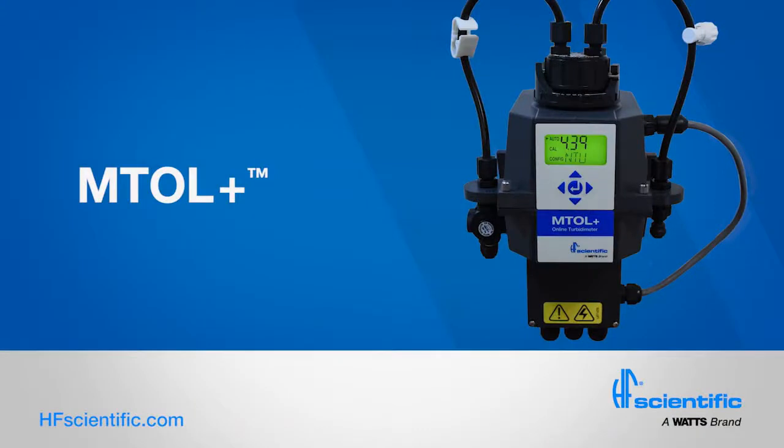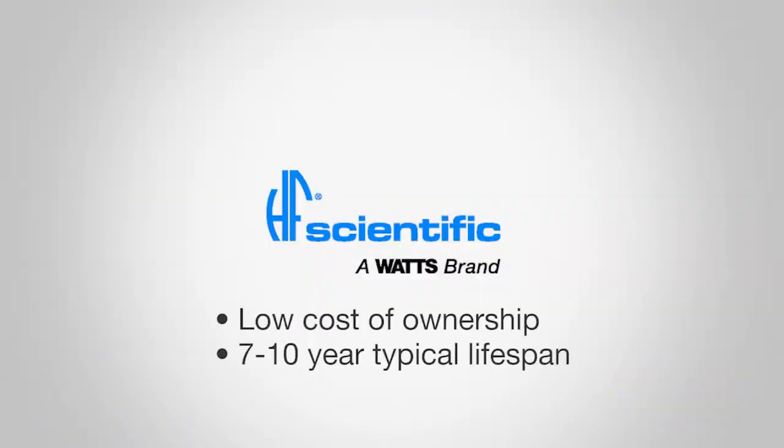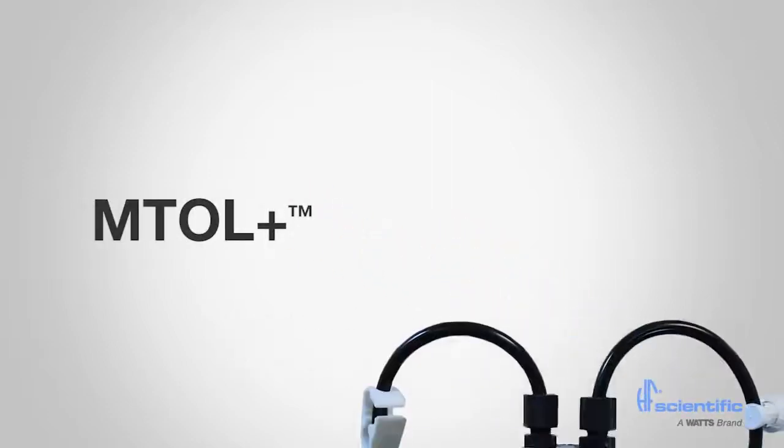HF Scientific has been designing and manufacturing robust, accurate, long-lasting turbidity instrumentation for over 30 years. Our turbidity meters offer low cost of ownership, with typical lifespans of 7 to 10 years. This video features HF Scientific's latest turbidity meter, the MTOL+.